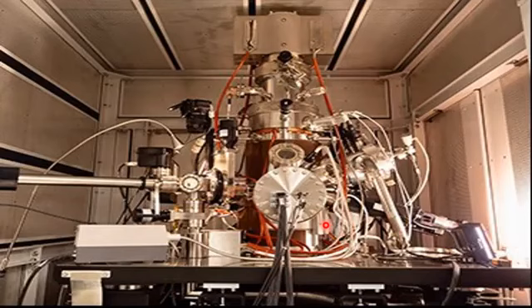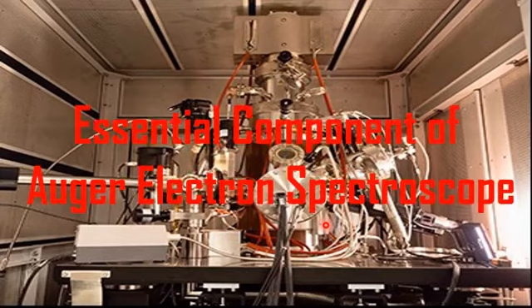Dear student, let us discuss the essential components present in the Auger electron spectroscope. The Auger electron spectroscope is quite a diverse instrument, so let's discuss what the key components present in it are.